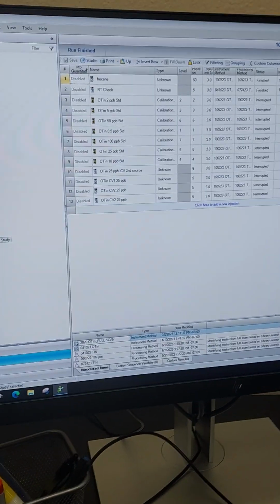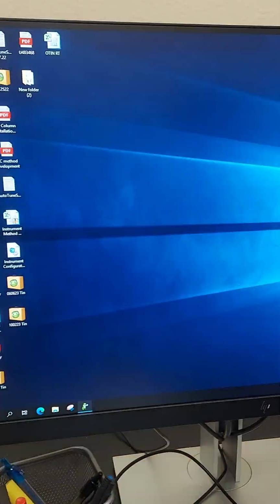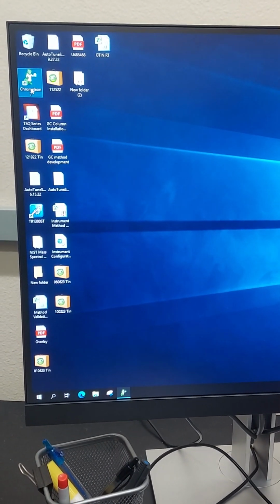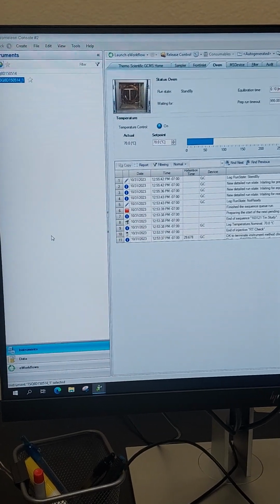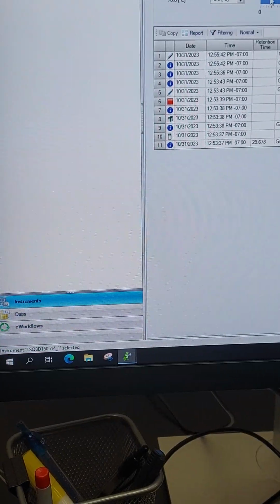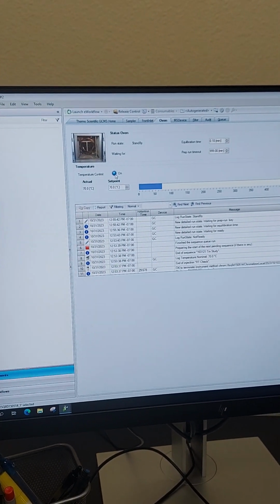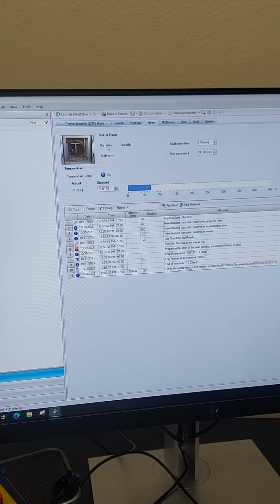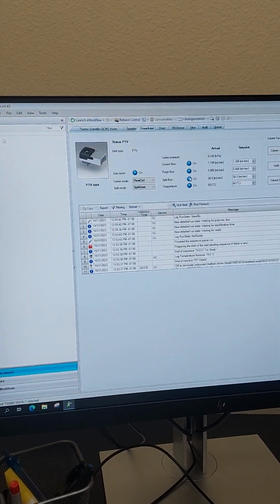This is the interface, Chromeleon console. Start right here. This one. And then this is for instruments. That's how you control the temperature. Whenever you do maintenance, you want to turn this oven off, and then you also want all these to turn off.